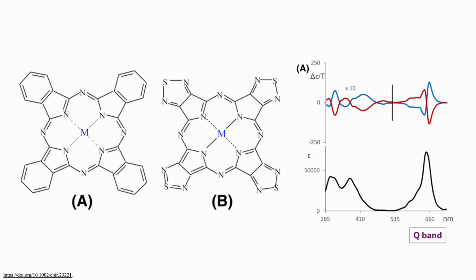So in conclusion, both of these recent examples wanted a better understanding of complexes' electronic structure, and they used MCD to do so. This is often paired with DFT calculations to find molecular orbitals of the complex before comparing that with MCD to assign specific transitions.